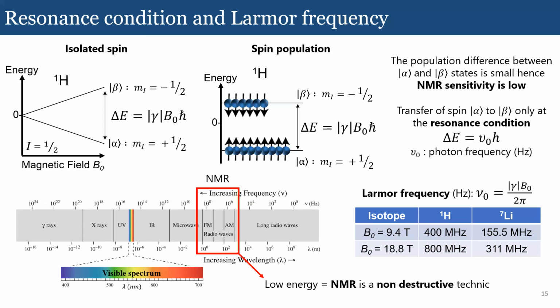Because if you consider any other spectroscopy technique, or almost any other, the sensitivity is super high. If you take infrared, that's, for example, really high sensitivity, Raman too, even if you have a saturation phenomenon. But on the other side, NMR is really the black sheep here: sensitivity in NMR sucks. That's the only thing I can say.